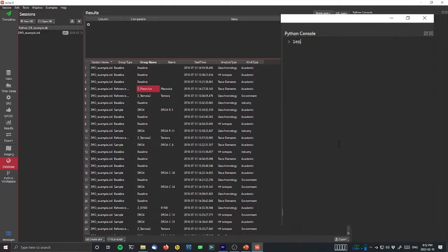And we can get the length of that as well. So that's how many entries we'll want to make in our new array. That's how long it will need to be. So I'm just going to duplicate that and say it's equal to some other text value. So I'll do that by, let's say new vals equals, we're just going to do list.